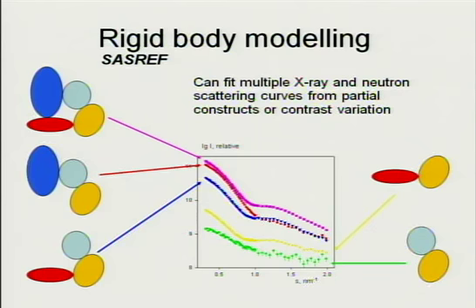If the individual components change conformation when they are in a complex, then small angle neutron scattering could help you to resolve that problem. However, it will be the same program, called SASREF, that could help you to construct such a complex of 4 subunits so that the subcomplexes would fit the additional data.